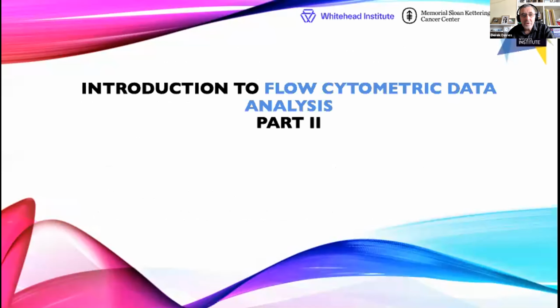As I say, we're going to look at flow cytometric data analysis today, following on from our first one about a month ago.